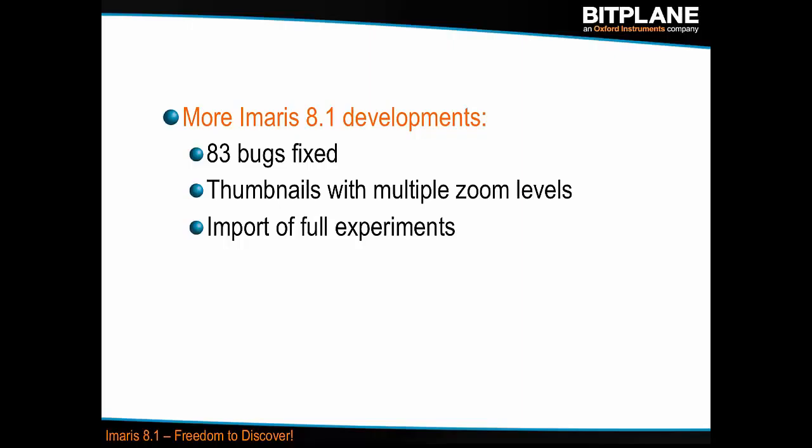So if you had an experiment with 100 folders, multiple days, multiple groups, multiple regions of interest, all of these things in multiple subfolders, you would need to recreate that. We created now a little tool that will just import the whole structure with the files inside. So it should make your life a little bit easier.